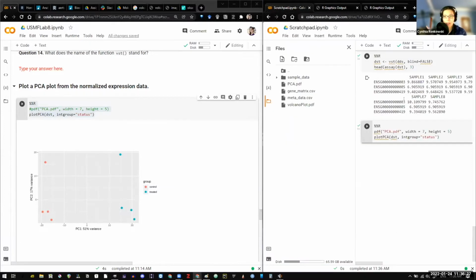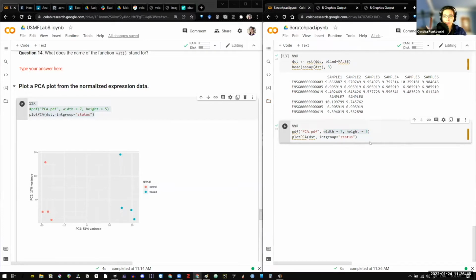The reason you do this is because it allows you to change the width and height of your plots. Pretty much, at least all the plots in this lab, but it should be generally applicable to most R plots too, unless the plots are made a very specific way.